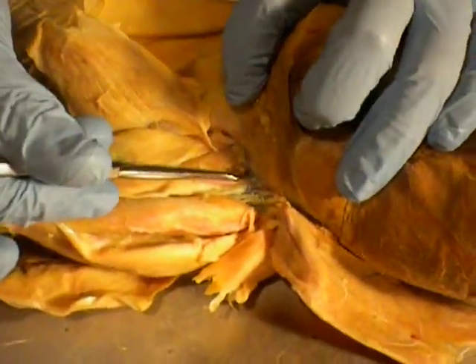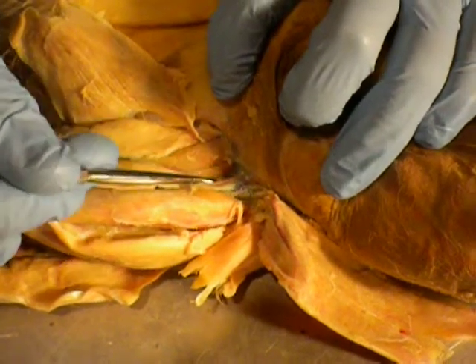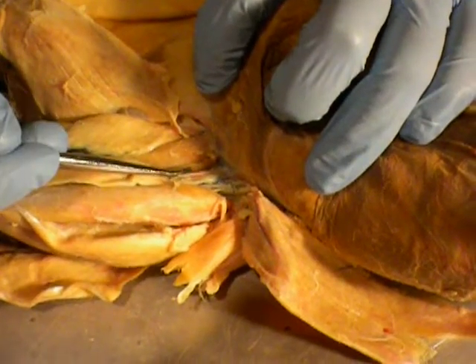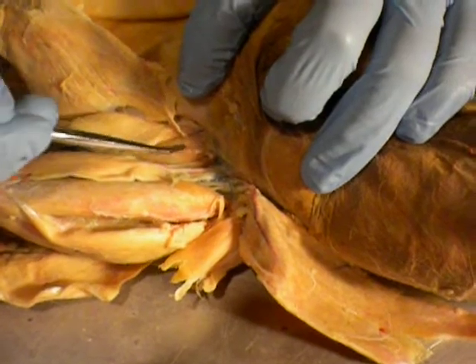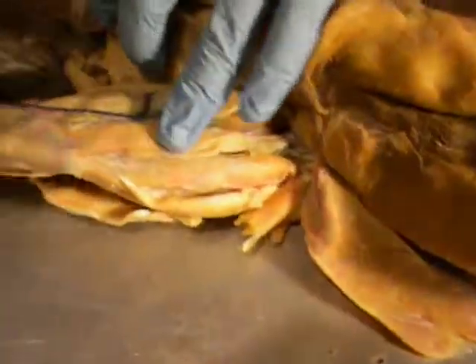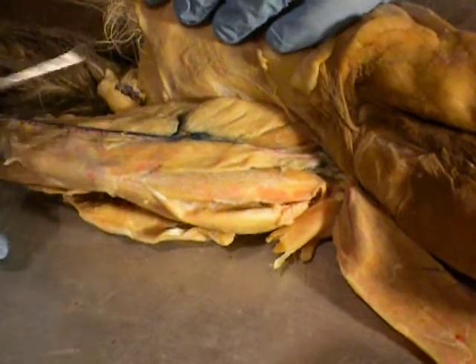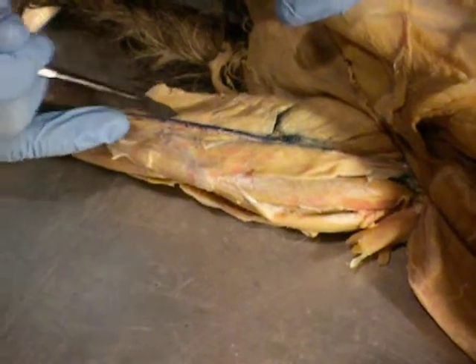Inside, underneath all of these veins and everything, there's a very small muscle called the psoas major. Next to it, we have the pectineus, which is very thin, small. We have adductor longus, adductor femoris, which is the first big fat pad-looking muscle. Semimembranosus, which is the larger one of the group. Semitendinosus, which looks like it would almost connect straight down to the leg.